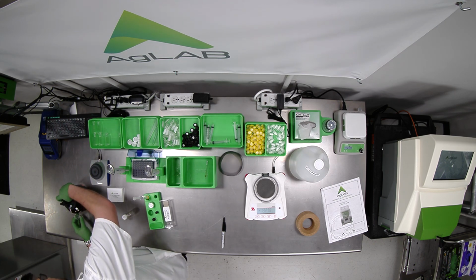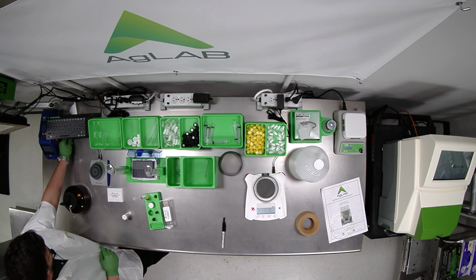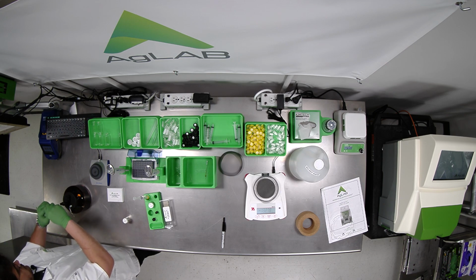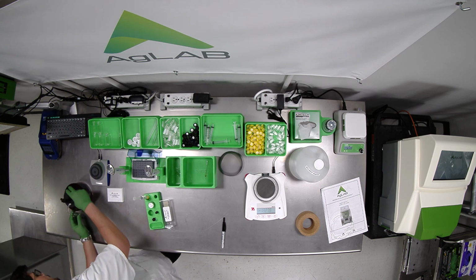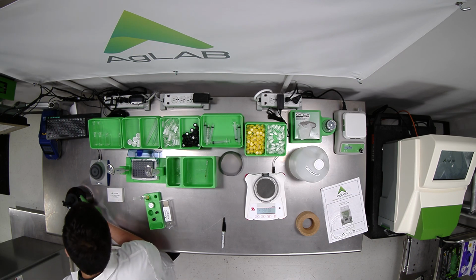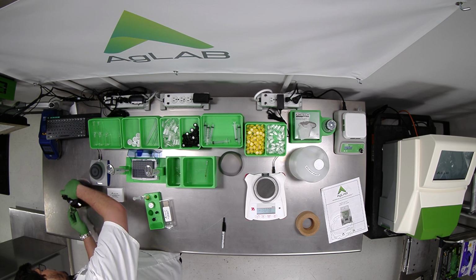Just gonna do a quick purge of this line. This pump doesn't have a purge feature. All right. Okay. Now ready to add our solvent. For our first dilution, this is going to be a 10 milliliter dilution. The pump is set here to 10 milliliters, so I'm just going to pull up all the way, pump down, avoid missing any drops here.